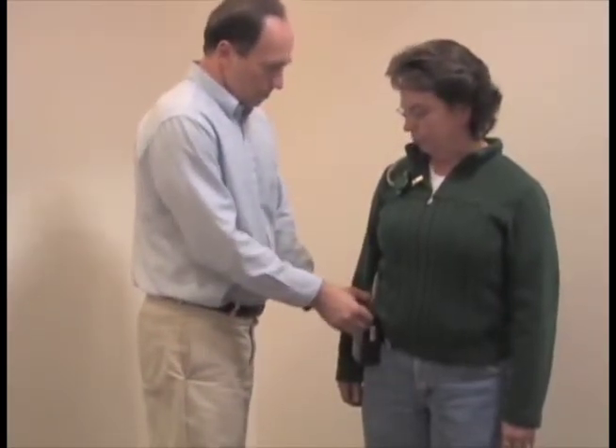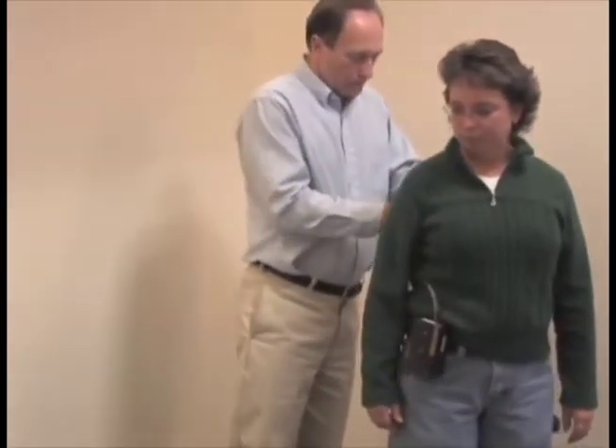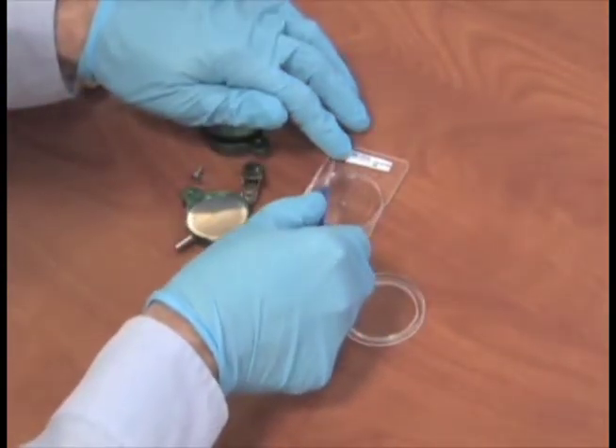Sample for the time specified in the method. After sampling, turn off the pump, record the total time sampled, and remove the sampling equipment from the worker. Then, remove the filter from the sampler and place it back in the same numbered Petri slide that you removed it from.